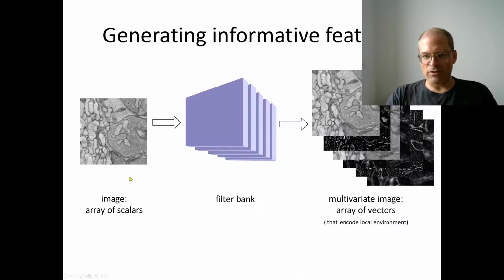And what we are doing here, that's a very generally applicable scheme: we take some image, it may be a gray value image, it may be a color image, then we send this through some filter bank. So it means we extract all kinds of new images that you see on the right-hand side. And these new images can result from a mere convolution, so from a linear operation acting on the original image. Or there are also important nonlinear filters that I may use to create these new images.